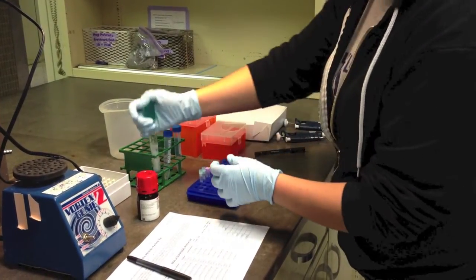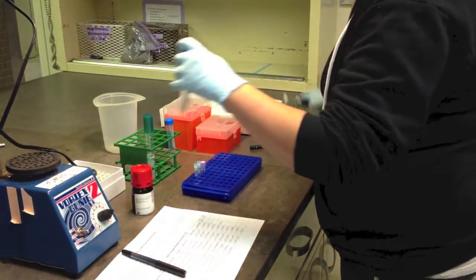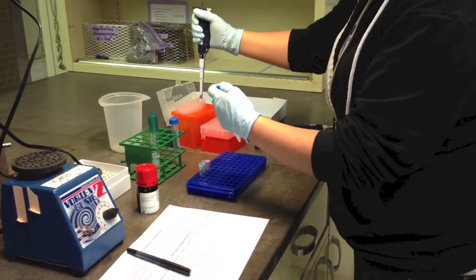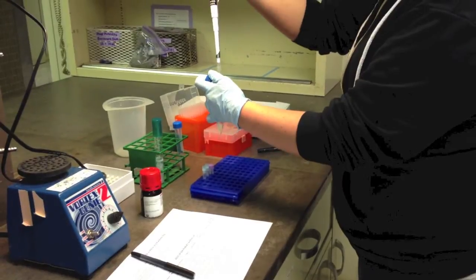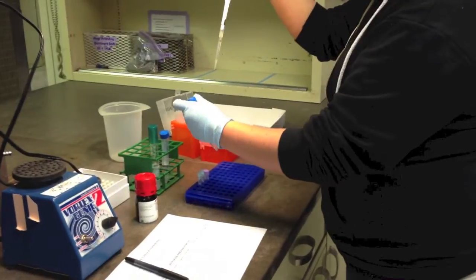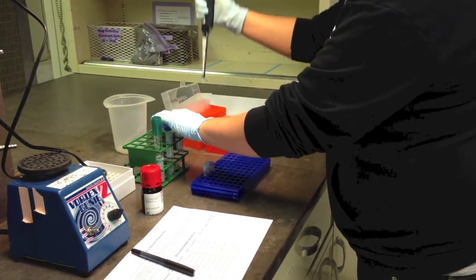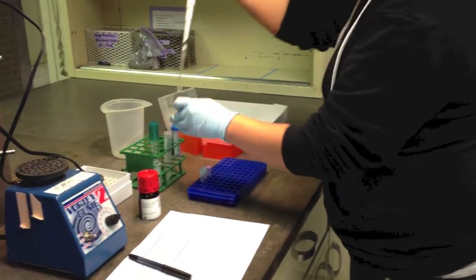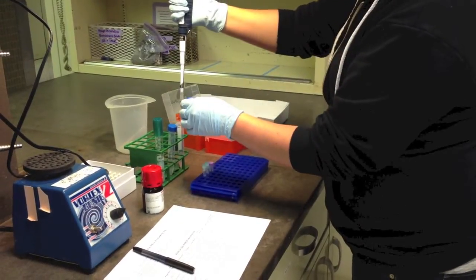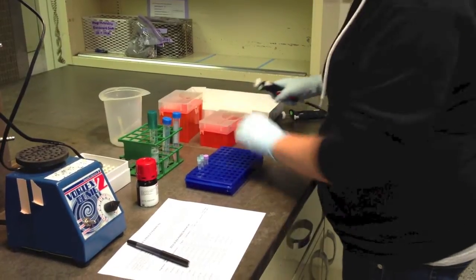After filling your sample tubes with beads, you will begin to prepare your mixture of phage lysate and DMSO for archiving. A final concentration of six percent DMSO is desired. We recommend that you prepare at least three milliliters of this solution for archiving. As you can see here, our technician is using extremely sterile technique. It is very important that you do not mix lysates during this process.